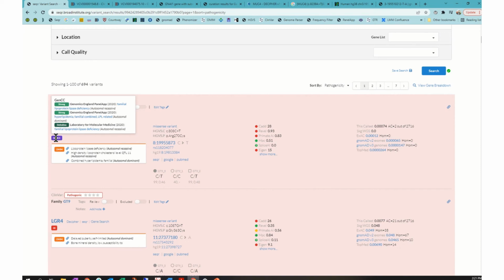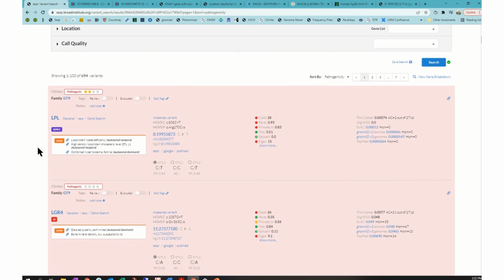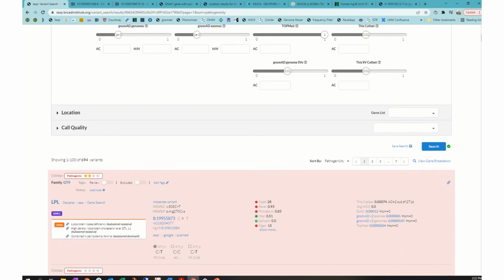Incidental findings are disease-causing variants that are found in an exome or genome that are unrelated to the indication for testing. And these are somewhat controversial in terms of return. There's guidance available from ACMG and other professional societies that can help guide you on this, but it really will be up to how you handle incidental findings, whether you would consider even reporting this variant at all. From my perspective in the analysis of the neurodevelopmental phenotype, this is not a relevant variant for this patient.